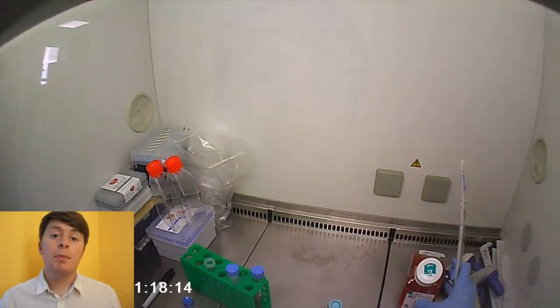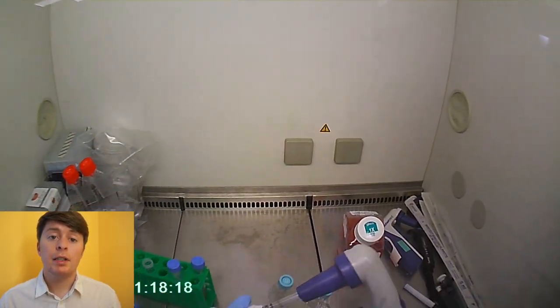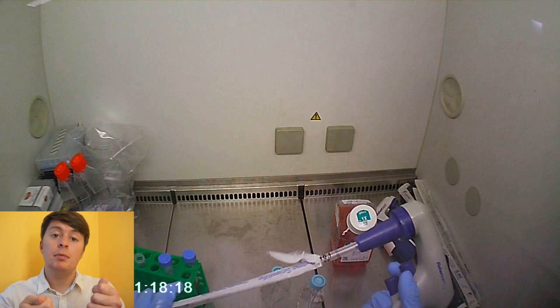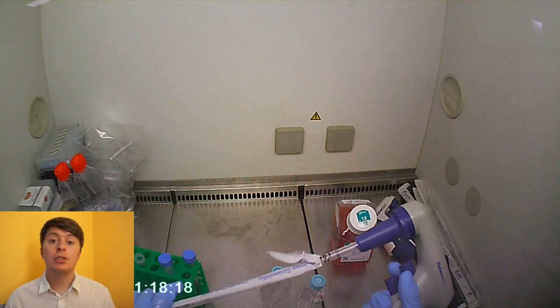And when you're using a stripette and you get it out of the packaging, never ever touch that stripette. The idea of the packaging is that you can just hold onto it and stick the automatic pipette bit at the top. So you can just tear it in a way that you never touch it. If you do touch it, it's probably best to use another stripette, because again, we really want to limit the exposure our cells have to the outside world. And we know our stripettes in the packaging are completely sterile. So why risk contamination when we can just use another stripette?